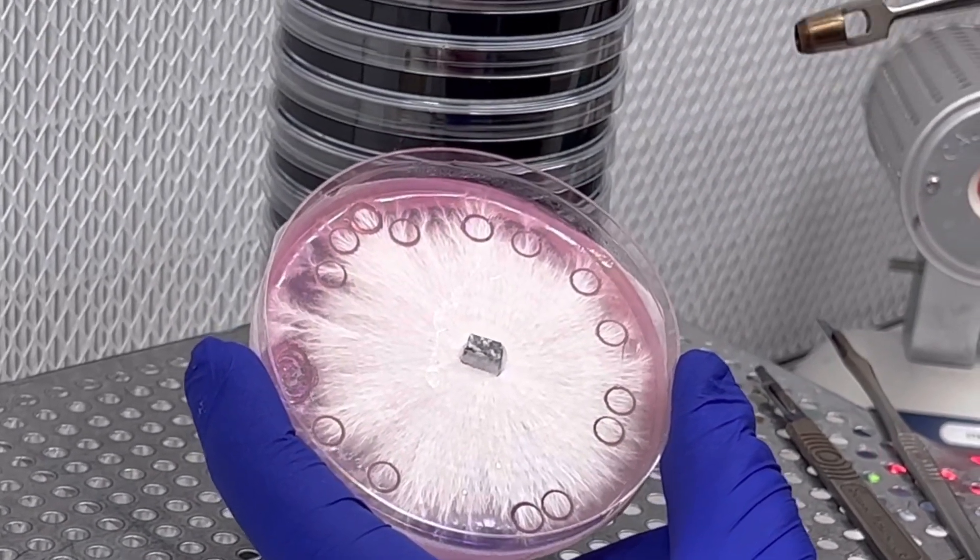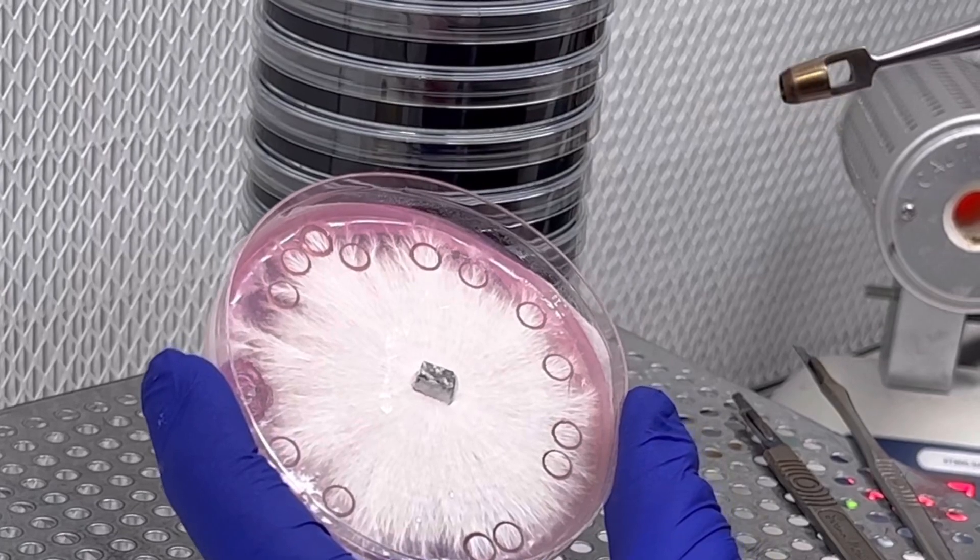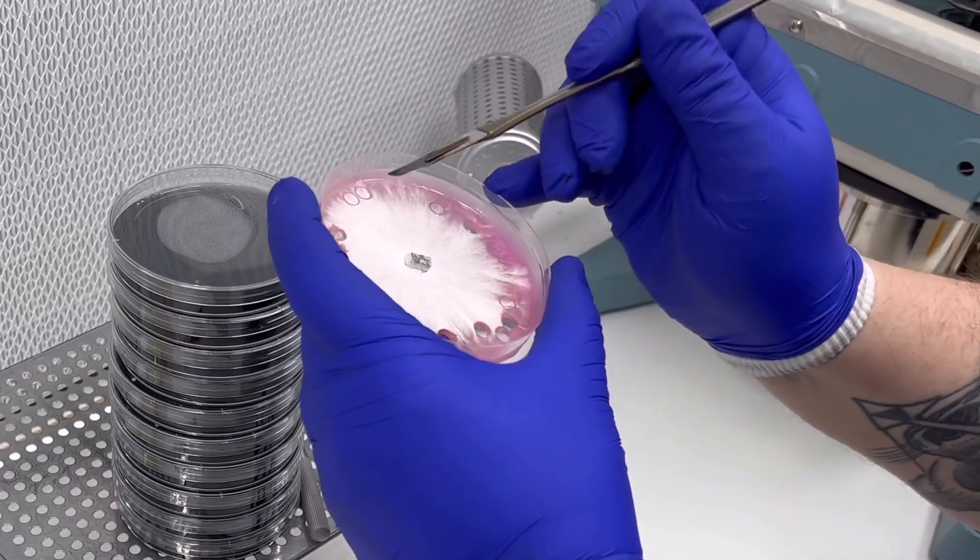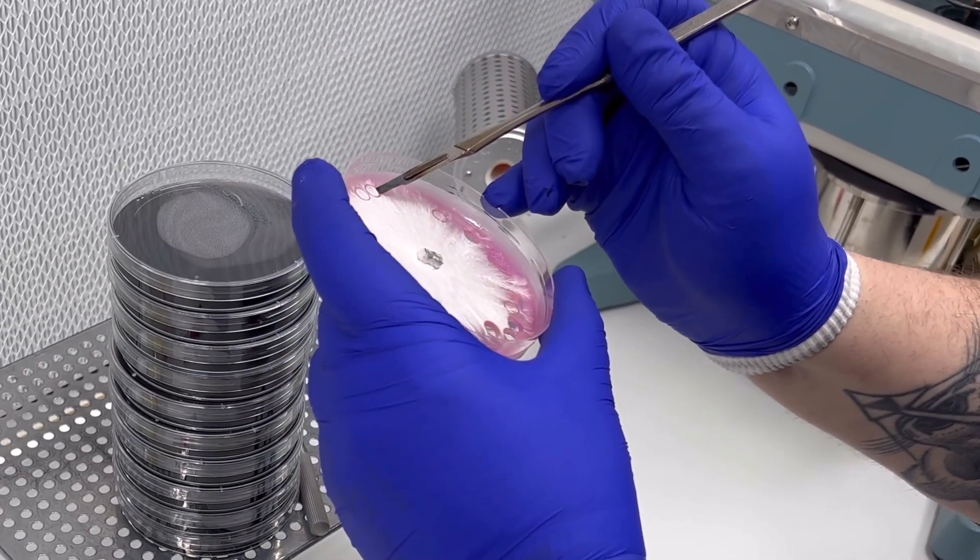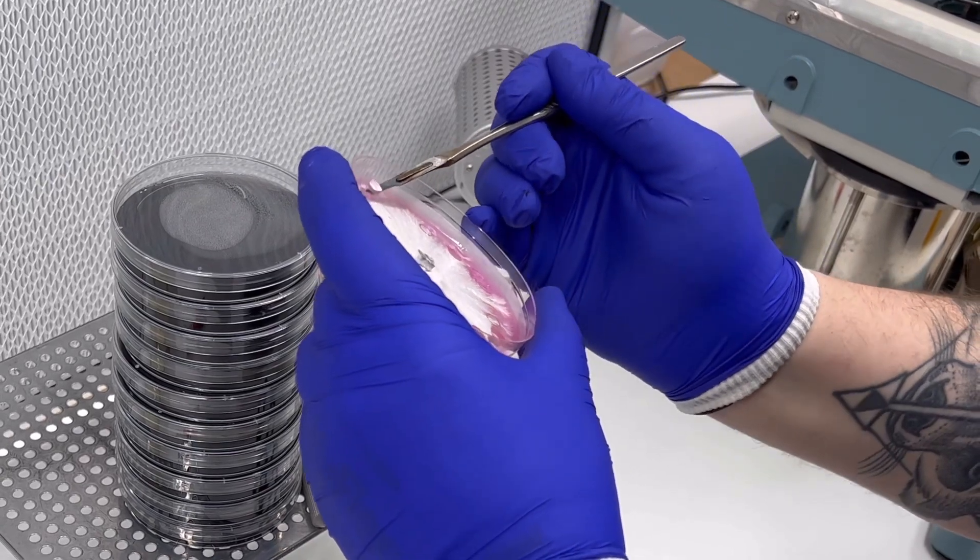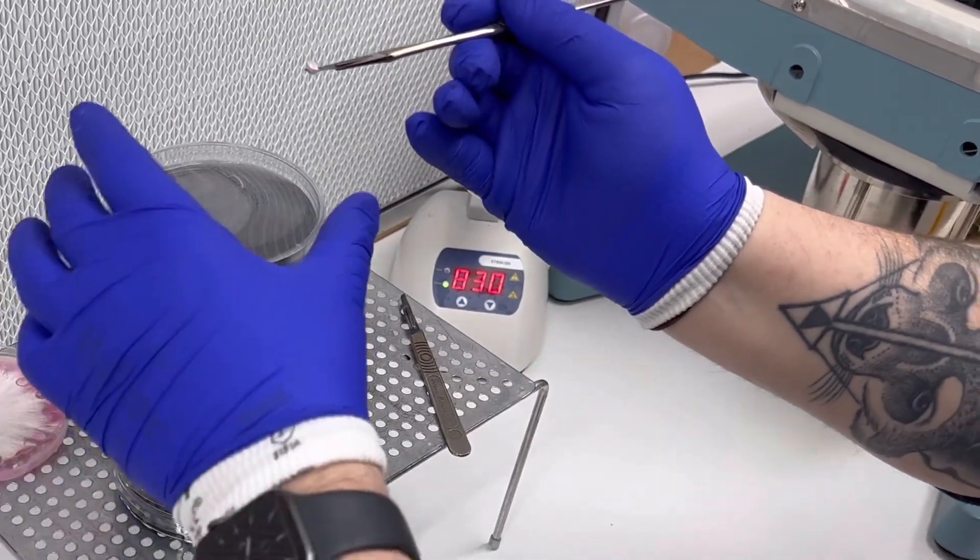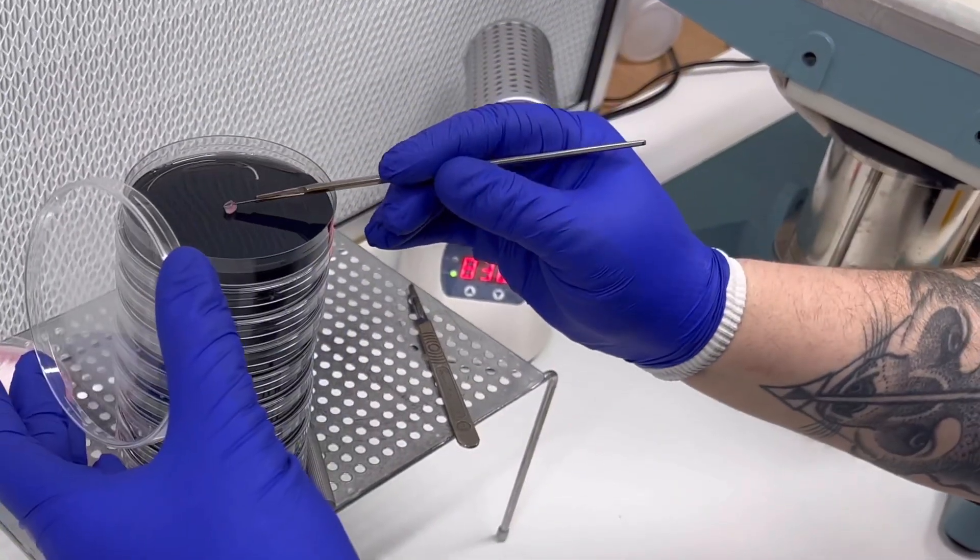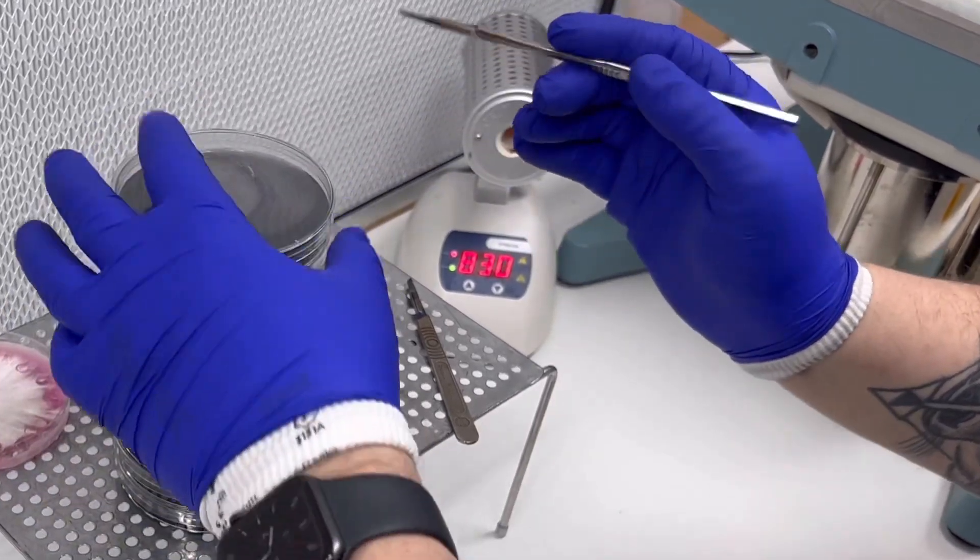We're now going to use a scalpel to just pick those circles out and place them upside down inside your new plate. Super easy, kind of makes transferring much simpler and easier than just cutting away at mycelium. There you go.